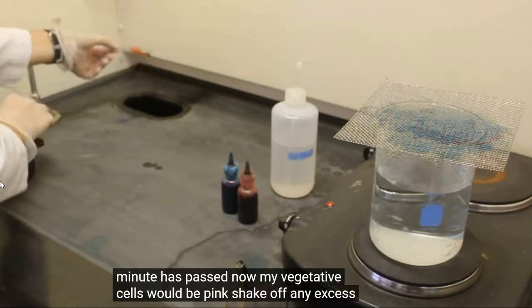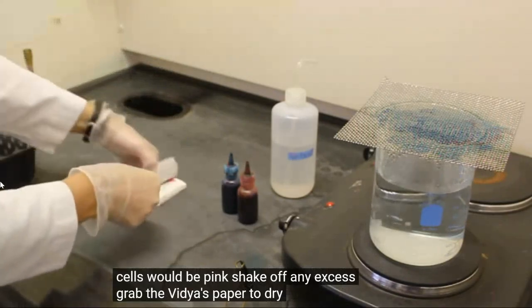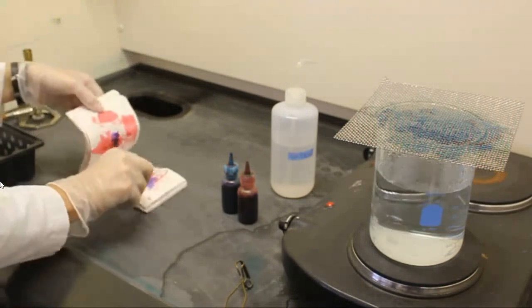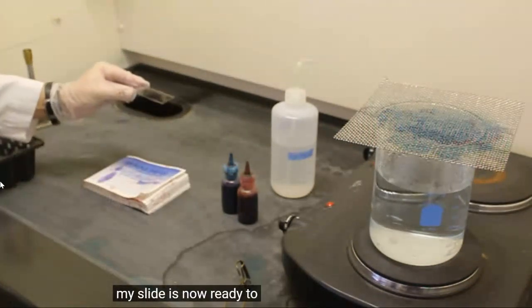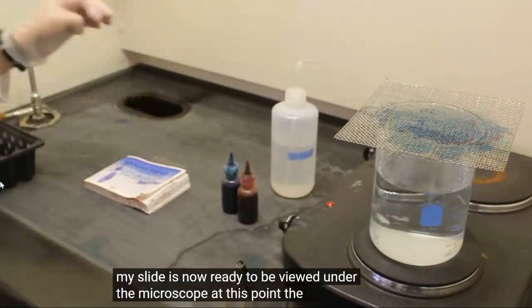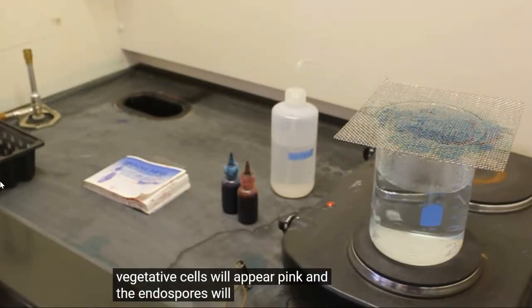Shake off any excess, grab the bibulous paper to dry. My slide is now ready to be viewed under the microscope. At this point, the vegetative cells will appear pink and the endospores will appear green.